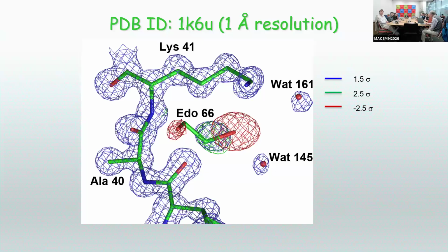So here you can see a small molecule fitted to something, and obviously that doesn't fit. Unfortunately, that's from one of my structures. I didn't pay enough attention to what my colleague submitted to the PDB. So yeah, you sometimes correct yourself.